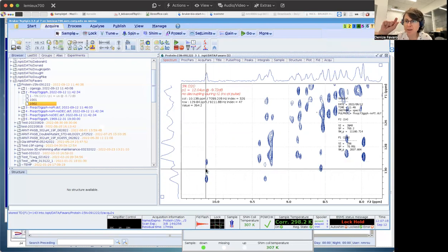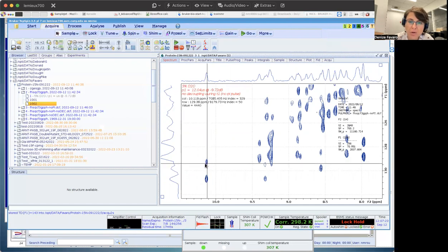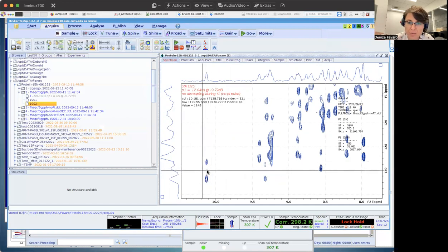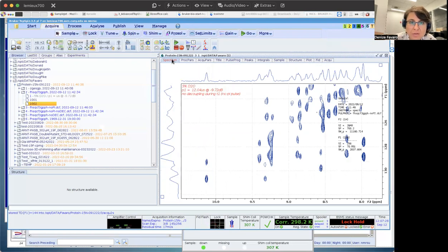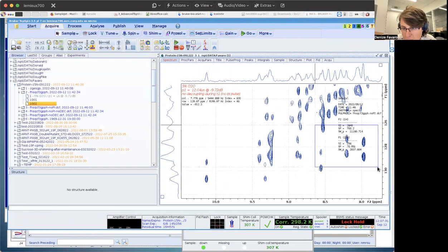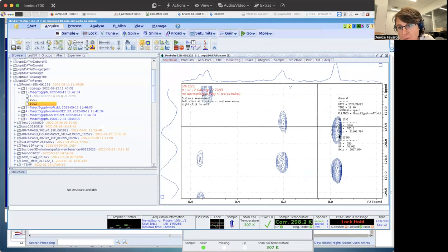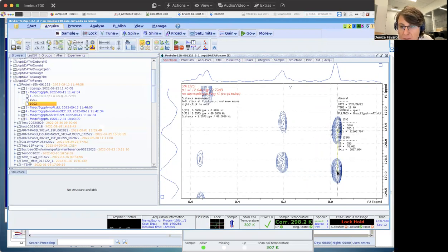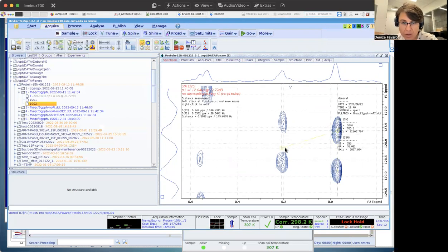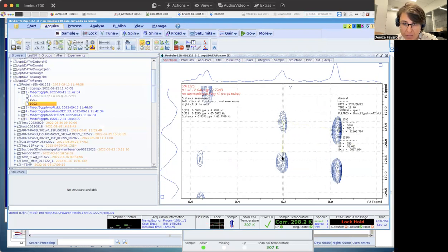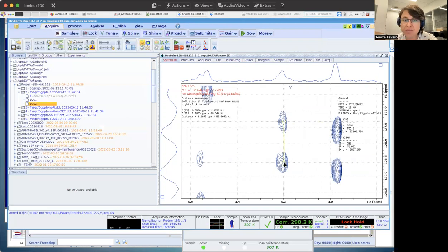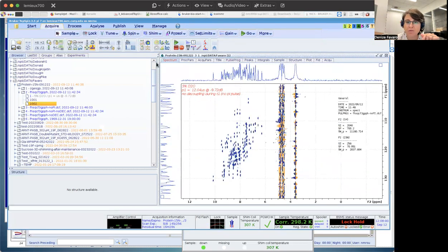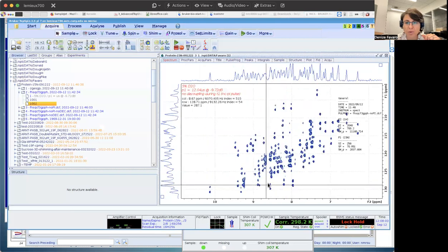If I put it back, go back to the regular one, I will collapse these two correlations into one, and they're going to collapse here in the middle. You see, if I measure here, the reason why we pick the constant four as 94 or 90, something like this, you see it's like 88. You can see on the left side you have 88 hertz. And if we go here and measure here, 90.5 hertz. So these are the splitting due to hydrogen and nitrogen-15 coupling. You see, it's all over my spectrum.